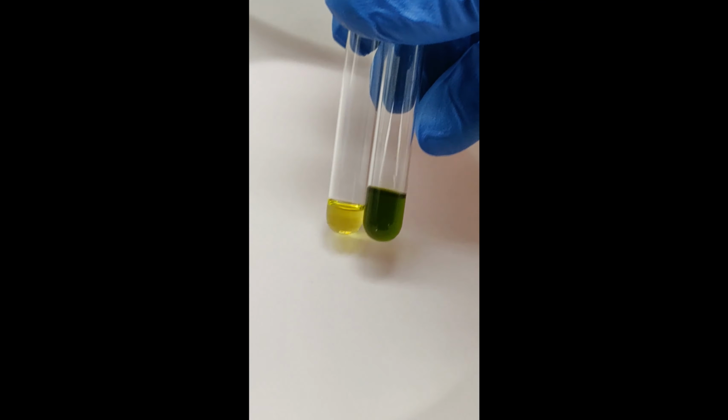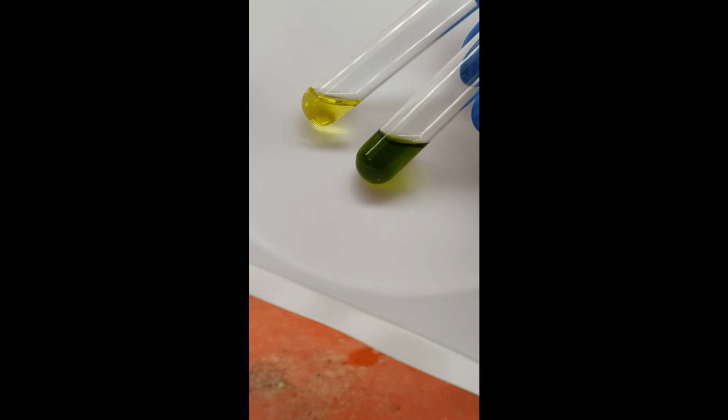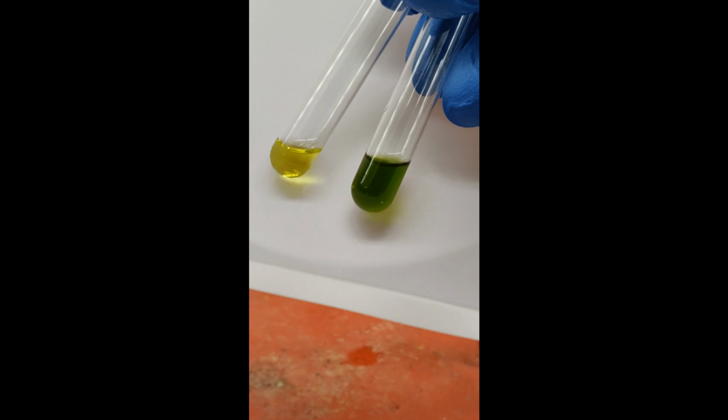Here you can clearly see the results of column chromatographic separation of the carotenoid and chlorophyll pigments extracted from parsley.